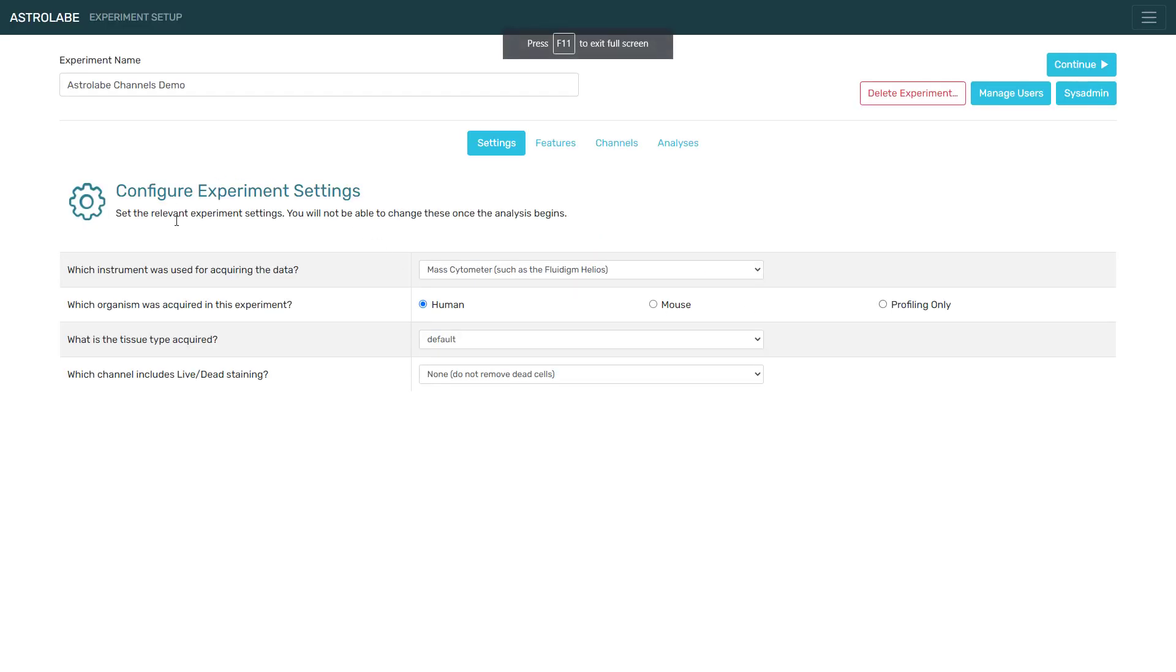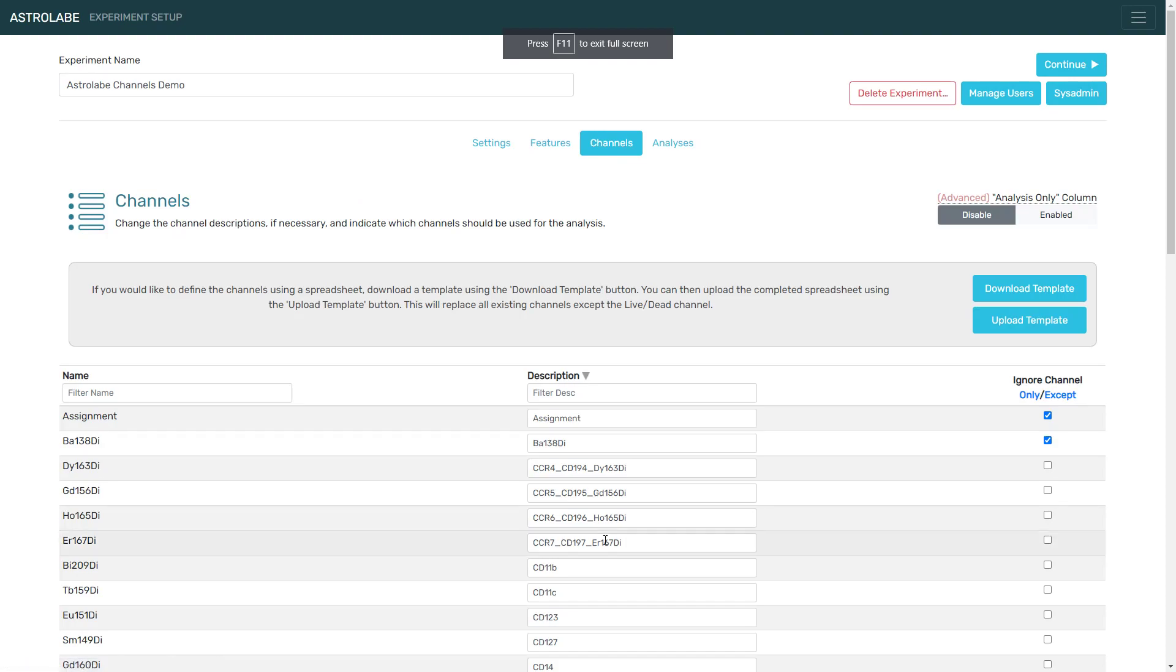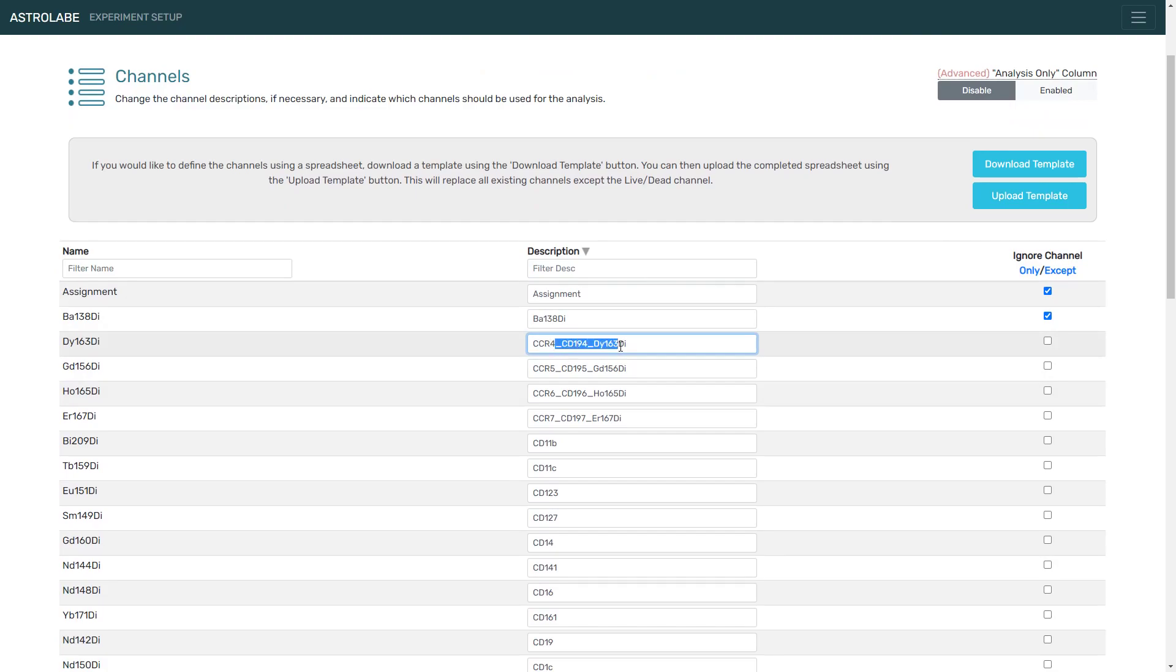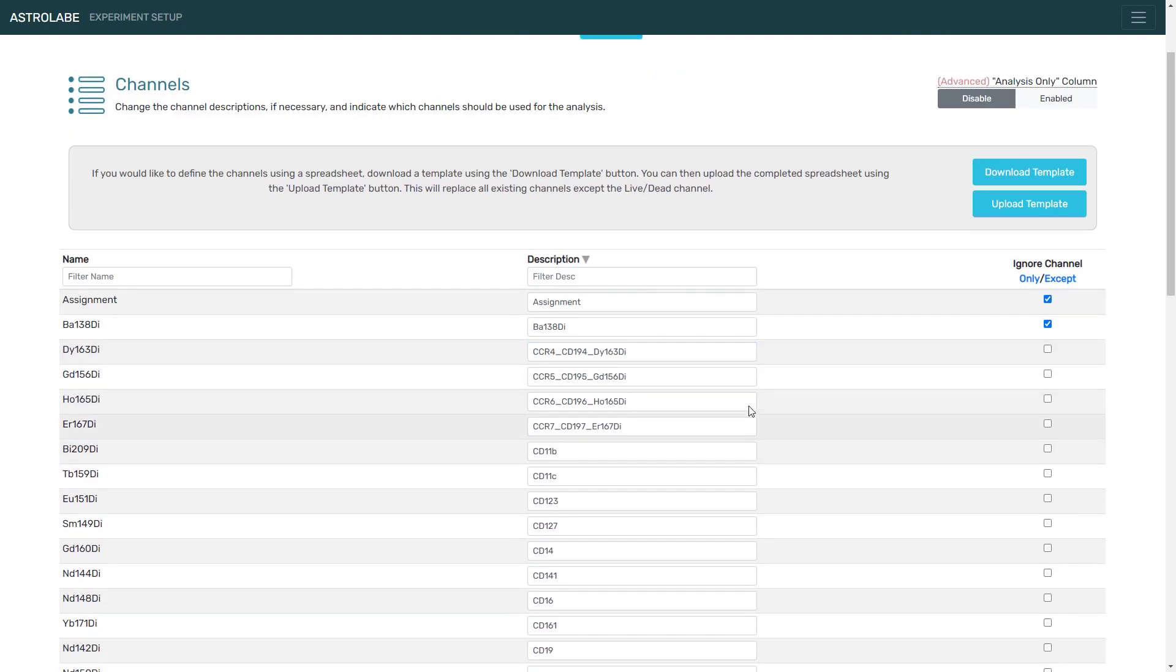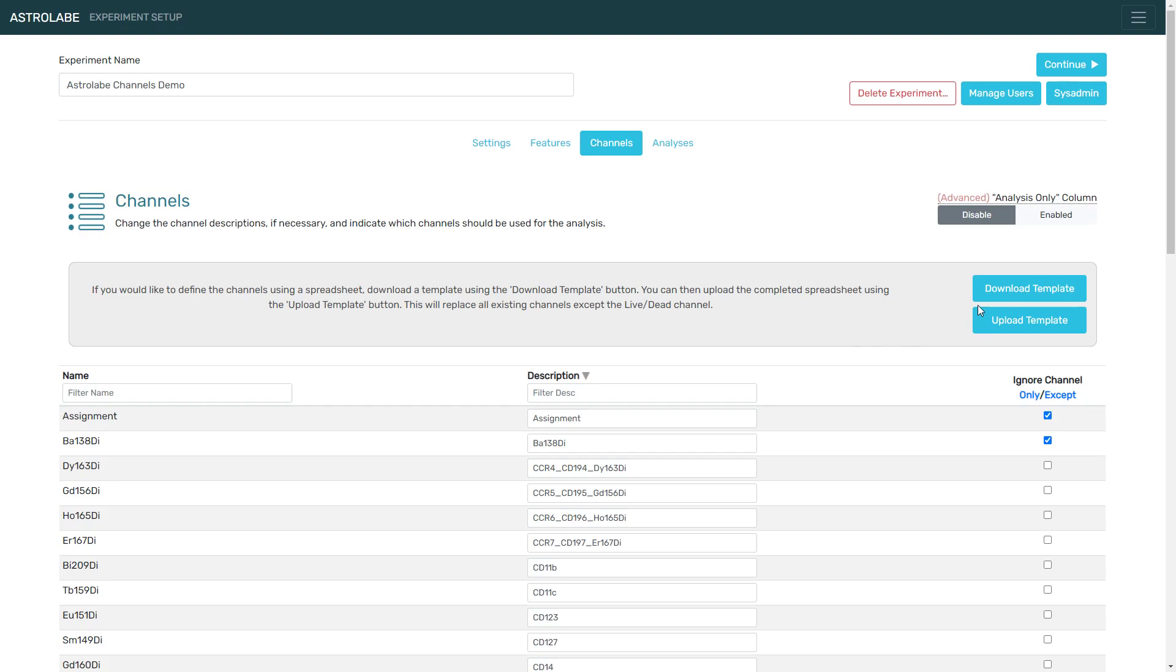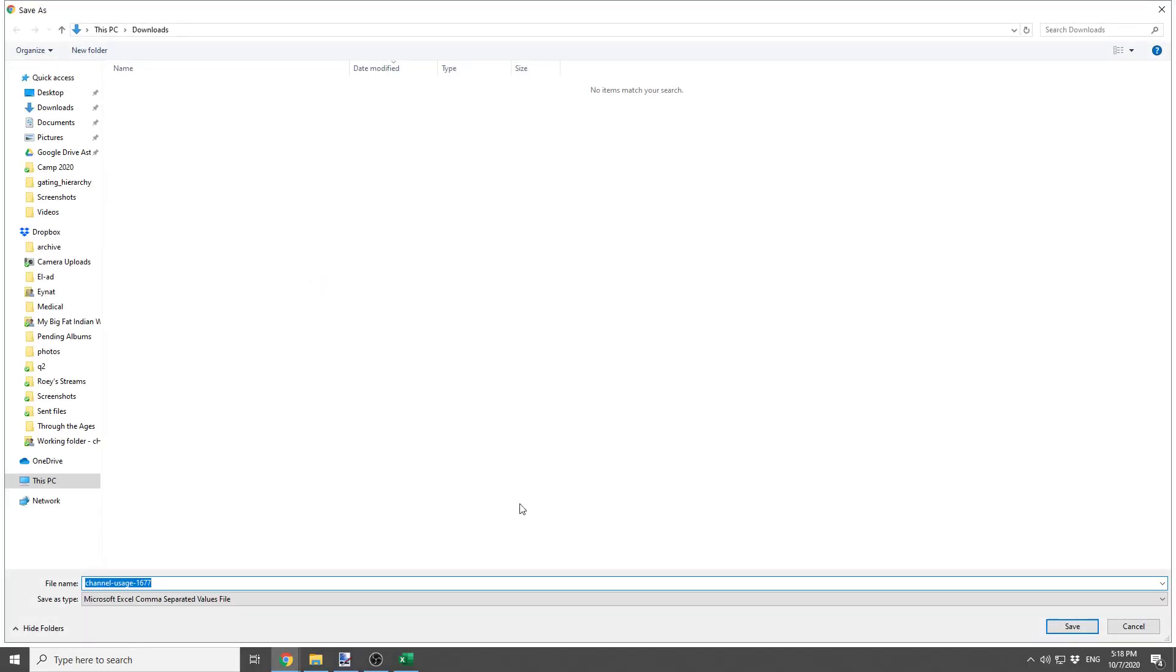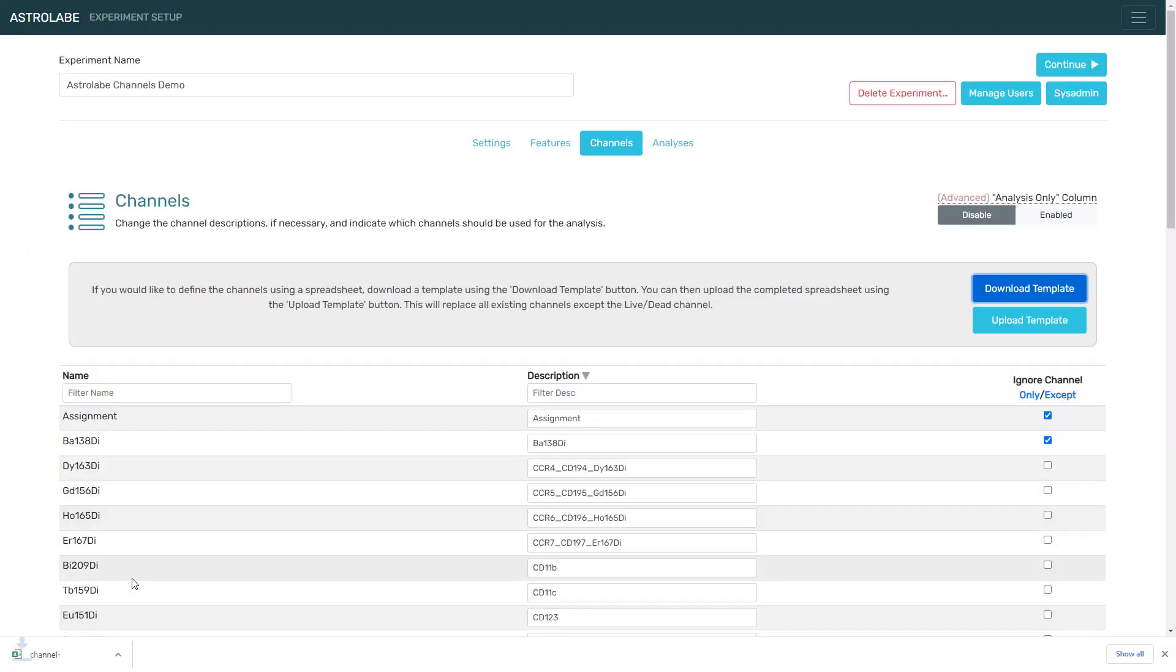So here is an example experiment, and here is the channels tab, and you will notice for example that this channel name is a bit messy, so we could shorten it through the interface. However, we might want to do it through the template, so I'm going to click here to download it, and this will give me a spreadsheet that I can open in Excel.